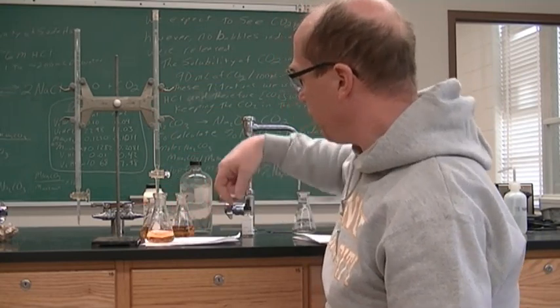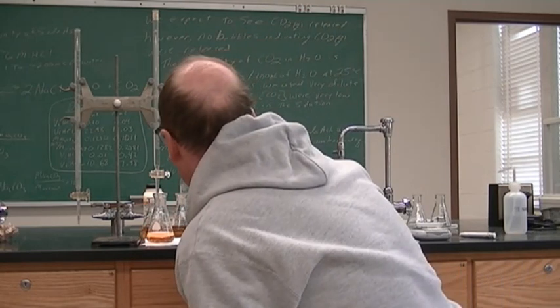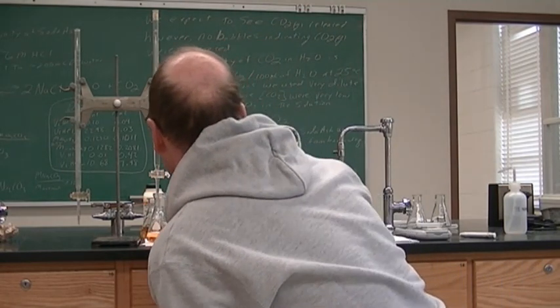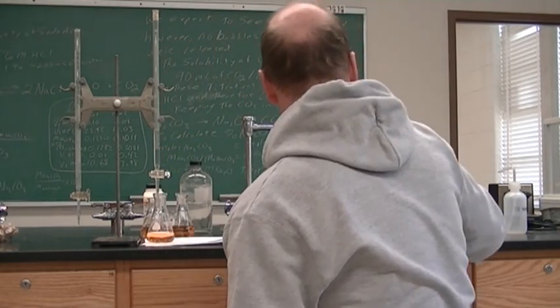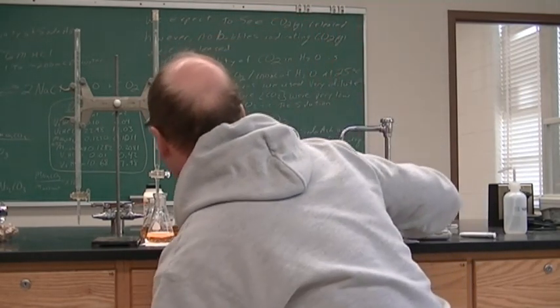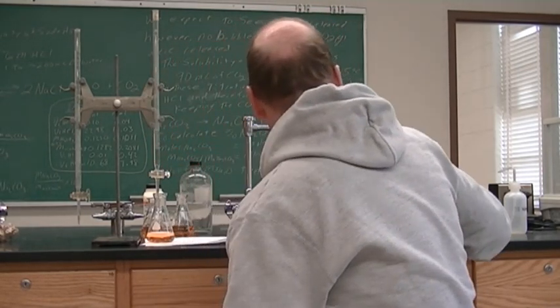All right, so again, we're starting yellow. And 1 drop will change it to the correct color. And so it is at 21.1. Sorry, 21.61. 20.61.